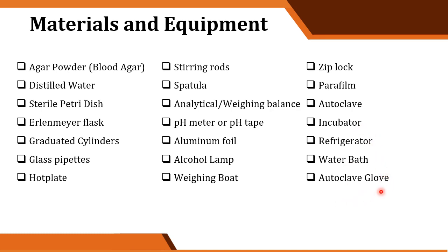Okay, so meron yun. So, yun lang dadalhin nyo. Distilled water, yung mga inyong petri dish, agar, ziploc. Aluminum foil, pasamahan na rin ng bulak. Yung malalaki po, yung nakaroll. Okay? Pero hindi naman ganun karami ha. Kahit yung pinakamaliit lang na nakaroll na bulak, hindi siya cotton balls.